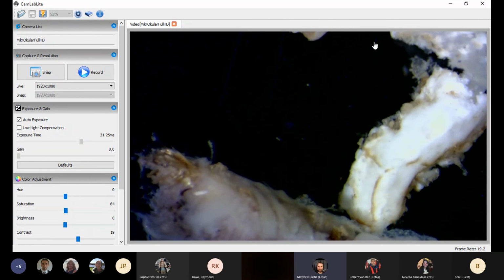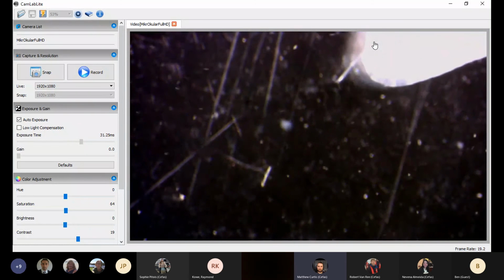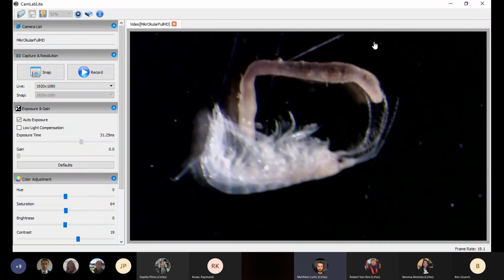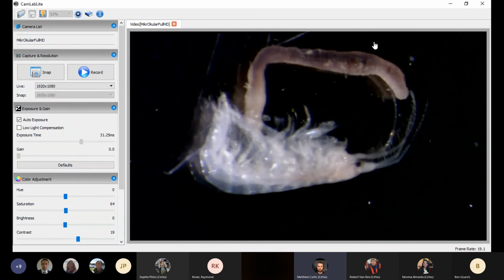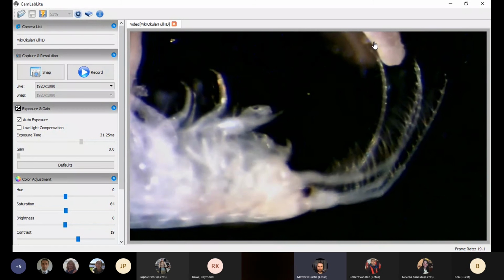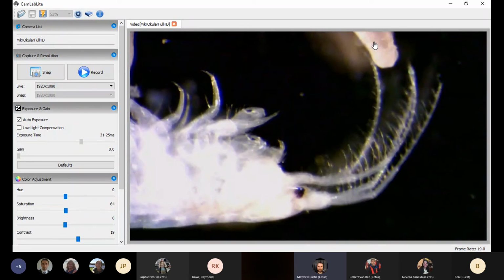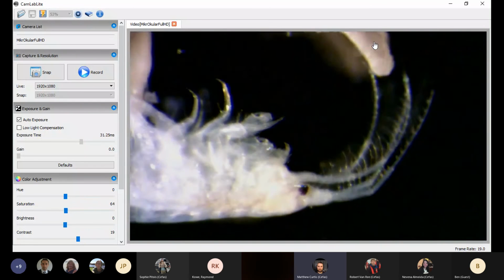And then a couple of examples of some other fauna we have. So that's a little Gammarid amphipod upside down. To identify these, we are looking at some very small features, so we have a high-powered microscope to actually zoom in on some of these features to help in our identification.